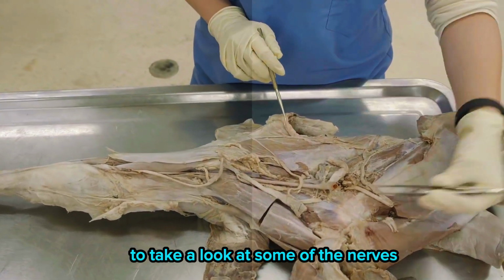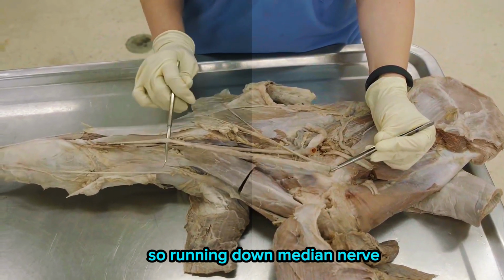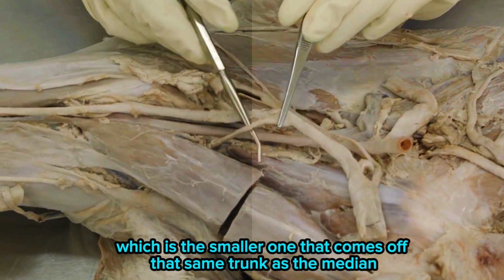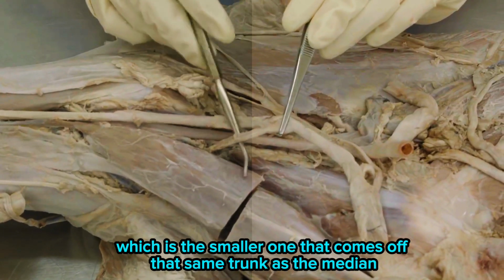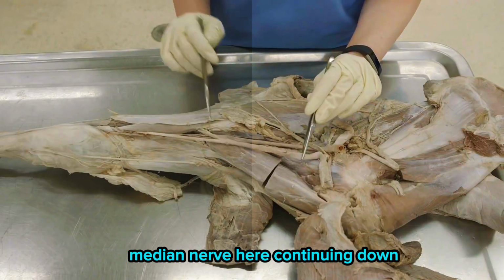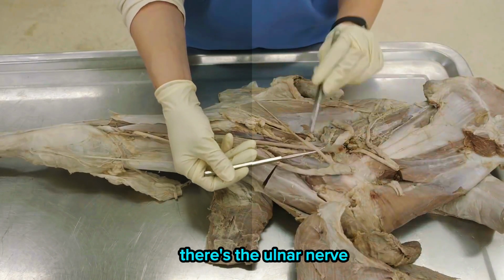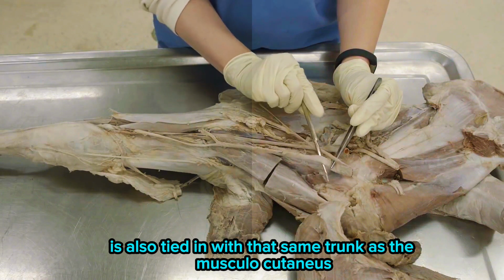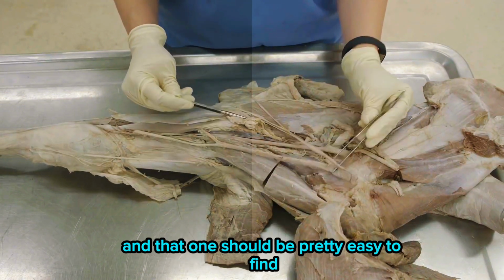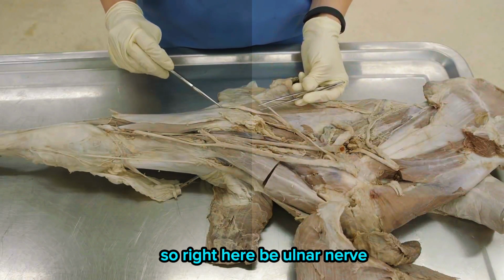All right, we'll back up a little bit and go a little more proximal again to take a look at some of the nerves. We just talked about that median nerve right here. So running down, the median nerve. Then we have the musculocutaneous, which is this smaller one that comes off that same trunk as the median, but we'll dive into the muscles. So the musculocutaneous nerve here, the median nerve here, continuing down. We also have on this calf the ulnar nerve, also tied in with that same trunk as the musculocutaneous and the median. The ulnar nerve should be pretty easy to find since it goes caudally towards the elbow joint. So right here, the ulnar nerve.